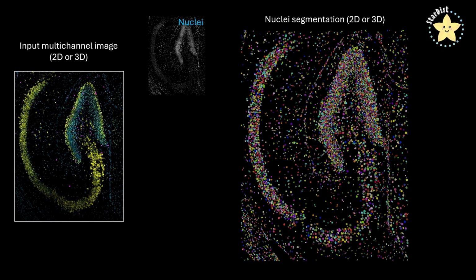The first step of the pipeline involves the use of StarDist to perform nuclear segmentation in either 2D or 3D. You have access to StarDist standard models to do so and some custom trained models that we train for our users. In addition, you can train your own model, but first you will need to annotate some of your data to provide ground truth to the system.